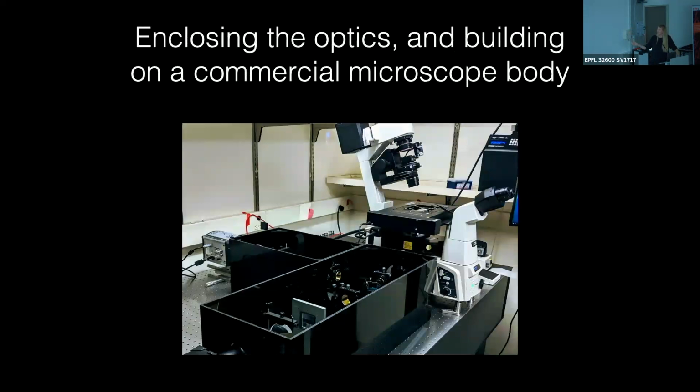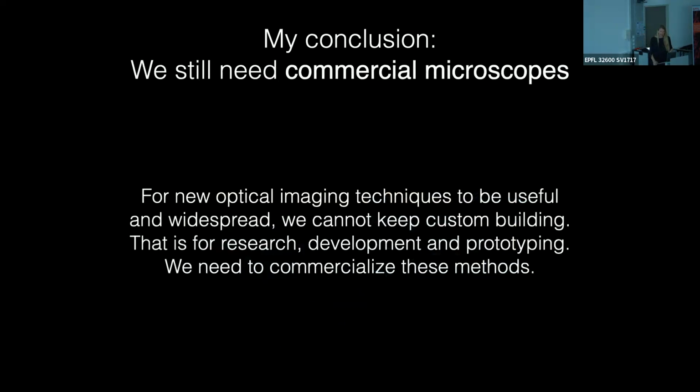Encasing the system is crucial, right? We want to have a little body. We want to have a regular microscope body, of course, with the eyepiece, which is super important for biologists to find their samples. Some days finding the sample is the hardest thing you do all day, right? But at some point, it's a long time since I invented this technique. I tried to build some systems for people who wanted them. It has to be commercialized. It's just something that needs to happen. It needs to be made robust.